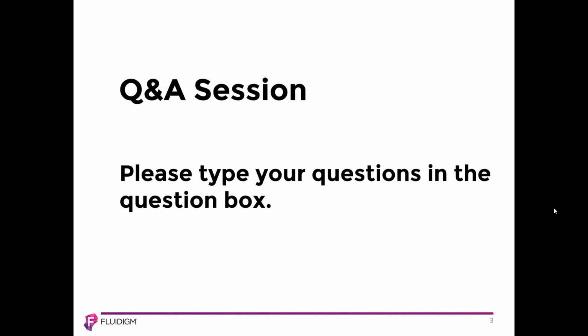Great, thanks, Anita. The next question is an imaging mass cytometry question. It says, could you please describe the IMC staining protocol and is it complicated? The staining protocol for imaging mass cytometry is actually quite similar to that for IF or traditional immunohistochemistry. The main difference is rather than using fluorophores with our antibodies, we're using metal conjugated antibodies. The rest of the protocol is quite similar with a rehydration step, antigen retrieval, and then you can stain all of the antibodies in your panel simultaneously, which saves a lot of time in your protocol.